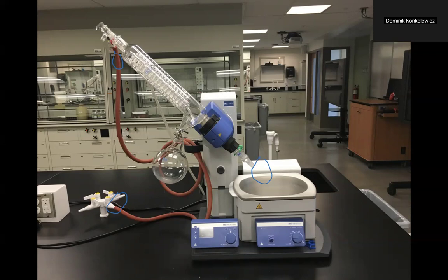It'll hit these coils which contain cold water running through them. It'll recondense and get collected down in this flask down here. As we continue this, we're going to remove more and more of our ethyl acetate, and eventually we're going to get our caffeine product at the end.